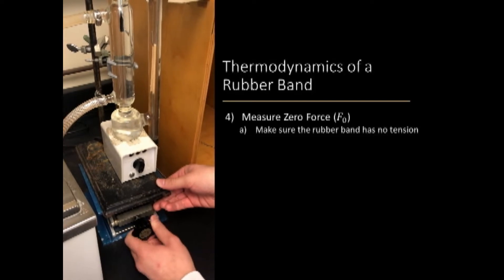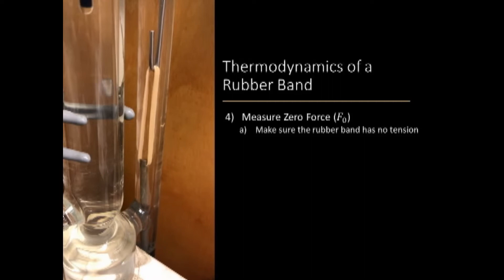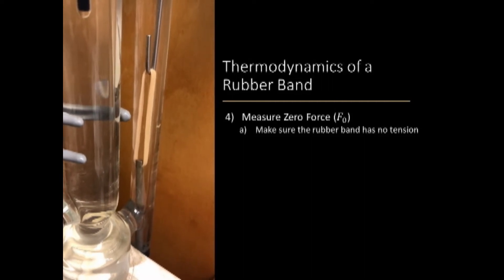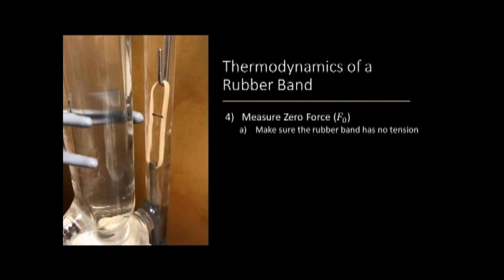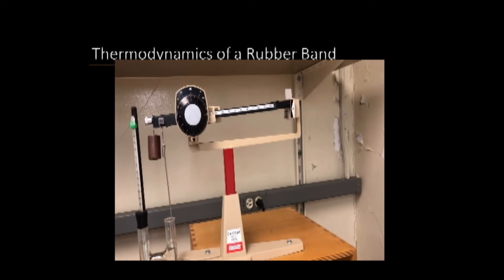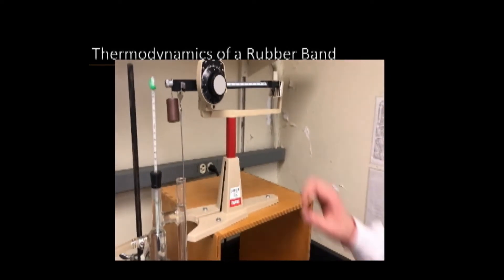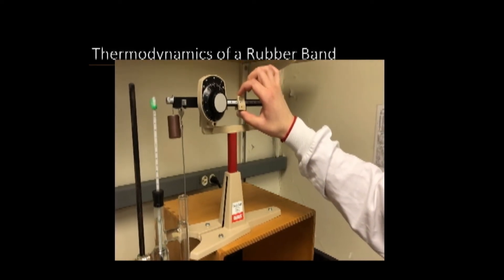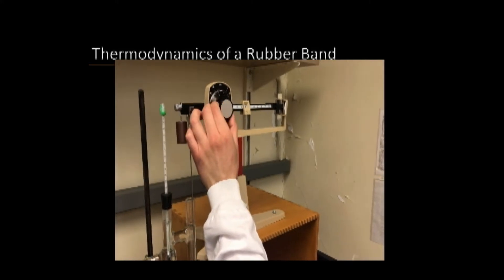To measure the F0, or zero force of the rubber band, adjust the jack to loosen the tension in the rubber band so there is only enough tension to hold the rubber band in place. The goal is to measure the force of the hook and the rubber band suspended in water. When a force measurement of the rubber band is being taken with the scale, start with the larger weight and work your way down to make the level straight. The dial can make adjustments as small as 10mg.